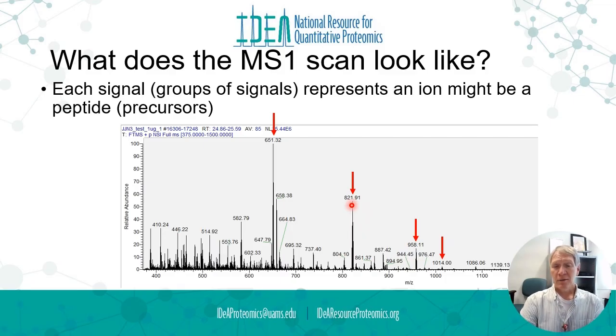right? Why? Well, because it's the most abundant. But most likely the peptide that we're really interested in is this little tiny one here that you can't see because of my camera, that's really, really small. But we can also analyze those too. So we have a decision to make as we get all of these signals: how do we isolate and send each one of these signals into the mass spectrometer to be fragmented and analyzed?